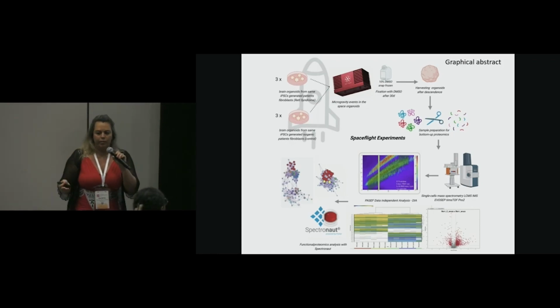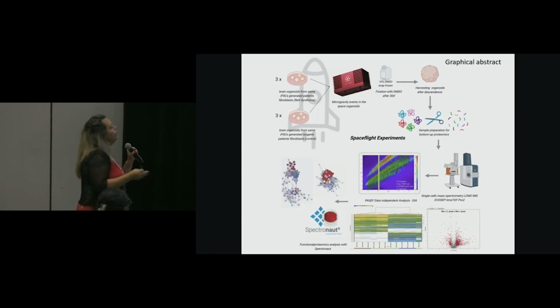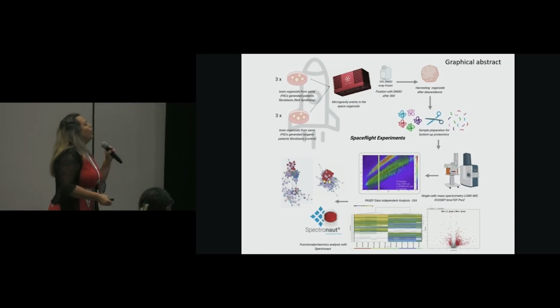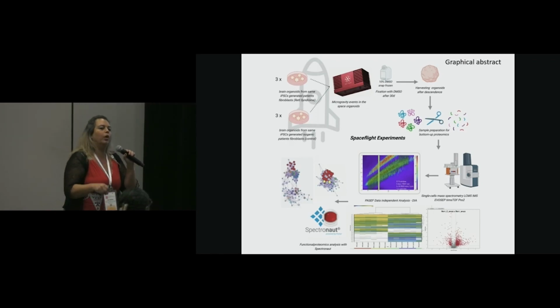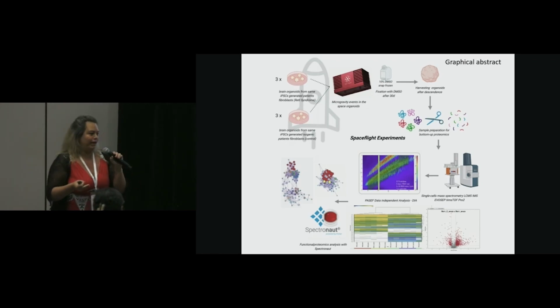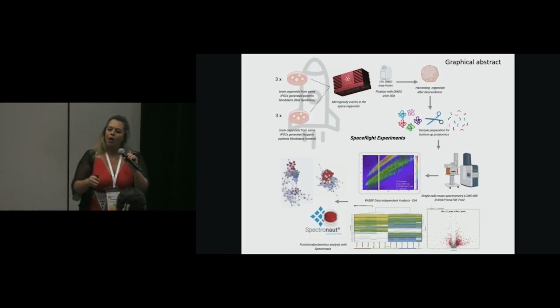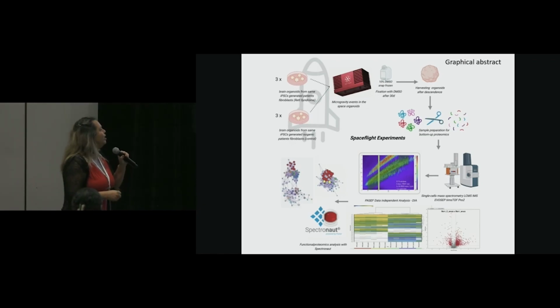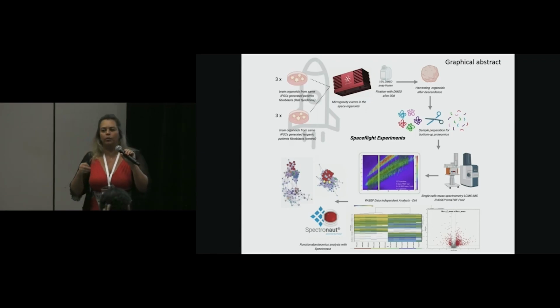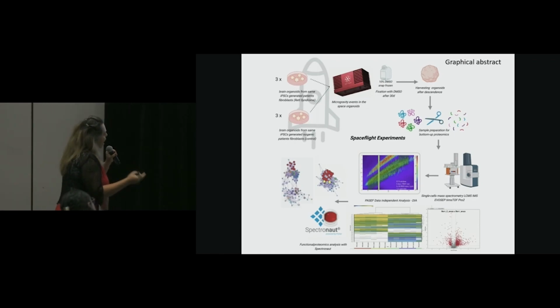We use timsTOF Pro 2 as an analytical method, and we acquire the data by DIA-PASEF, which is data-independent acquisition. Of course, we use Spectronaut to analyze this data because, as you can see, the samples are really rare. It's really difficult to place an experiment there because you have to use the cube lab, otherwise you won't have the isolation from the radiation. So we needed to use software that was robust, and we could retrieve the information back after this analysis.